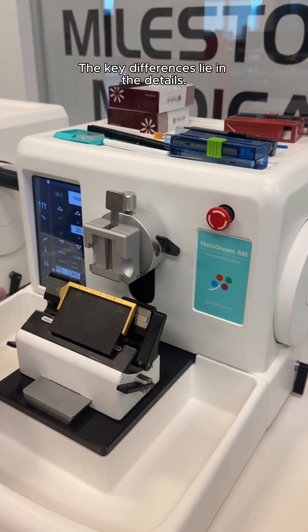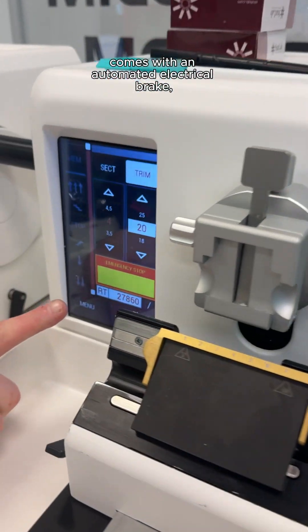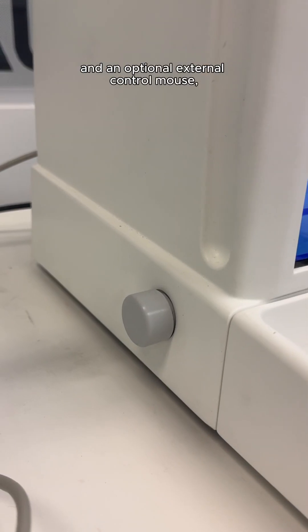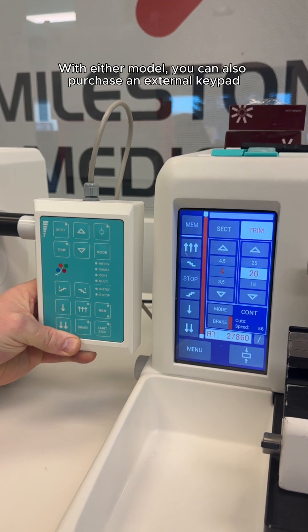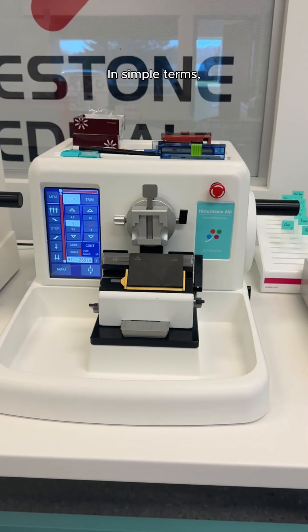The key differences lie in the details. The HistoDream AM, our fully automated model, comes with an automated electrical brake, an optional foot switch, and an optional external control mouse for added convenience and precision. With either model, you can also purchase an external keypad for increased comfortability and flexibility.